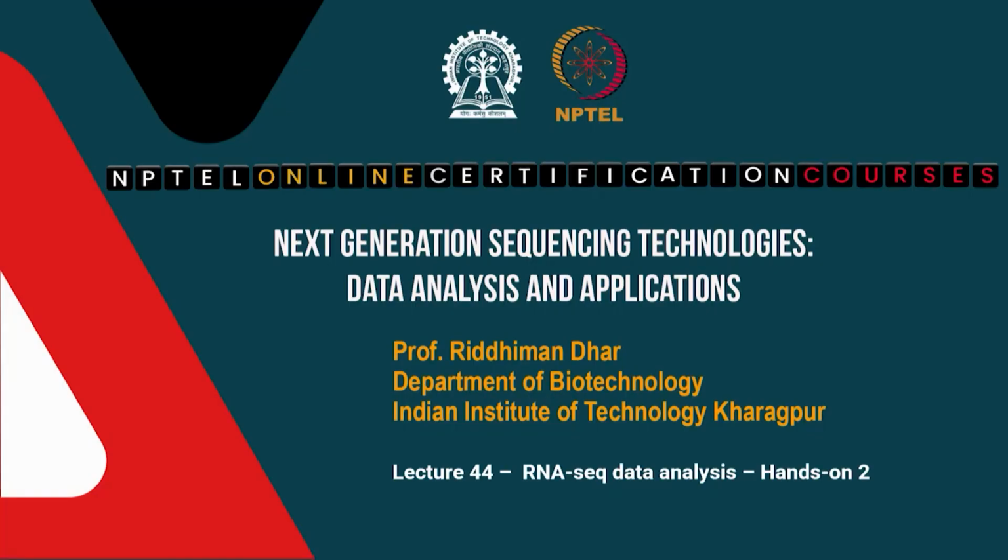So, what we are going to do now is we are going to implement all those, right. We will go through a hands on where we will analyze a real data set, right. So, we will take one data set and we will analyze this data set through all these steps. Okay. So, that is the agenda, which we will start with this class, and subsequently a few more classes will be devoted to this hands on.